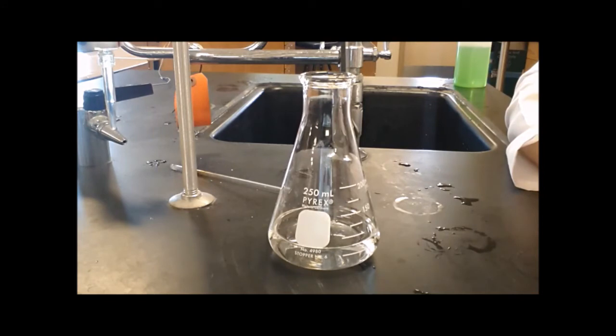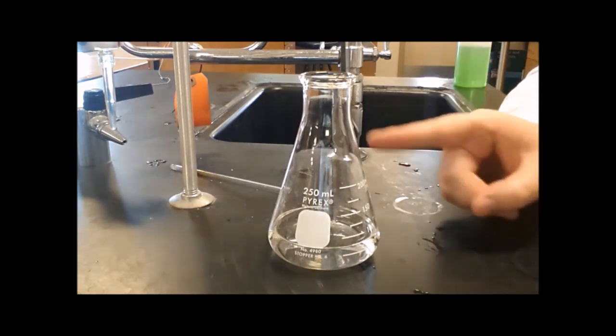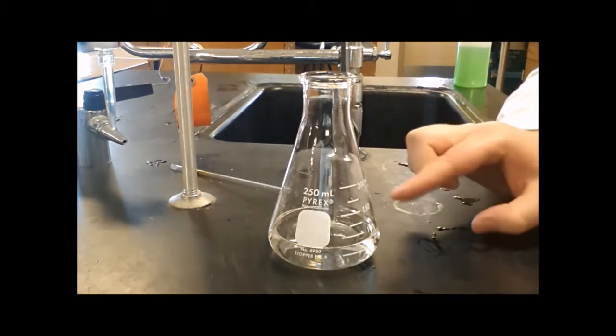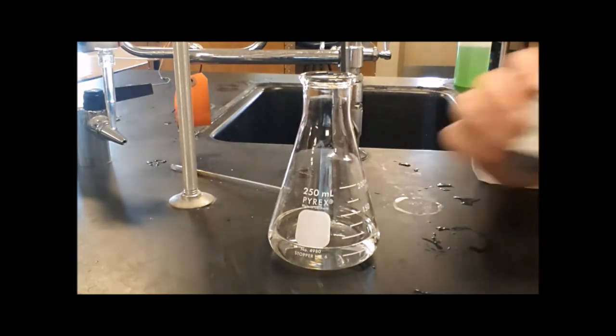Now I need to add some indicator. If you don't add indicator to this flask, you'll be titrating and titrating and titrating and wondering, where is the end point? When is the end point happening? I have no end point. Why no end point? I need end point. Where's the end? You forgot to add indicator.